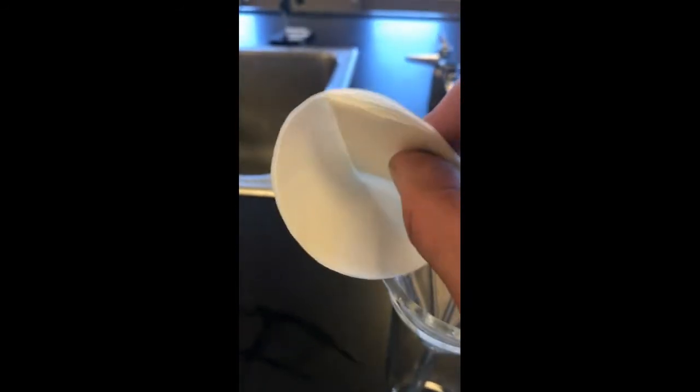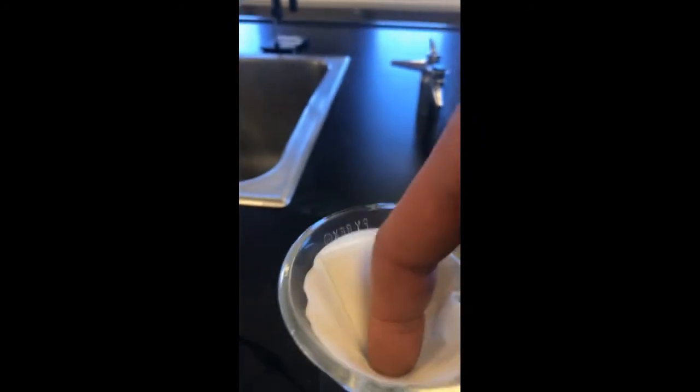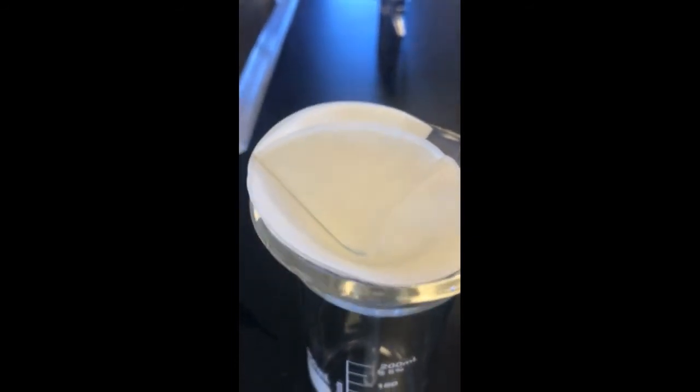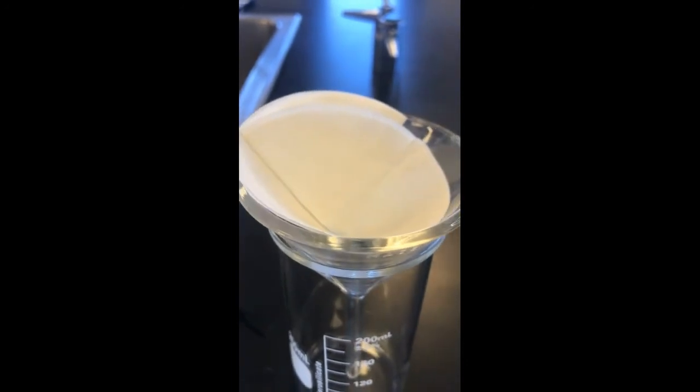Now, after the aluminum has finally dissolved, I've taken a piece of filter paper that was just a circle, and I push it into a funnel. Once this is fully dissolved, I'm going to pour the liquid and the precipitate, the solid that is floating in there, into this filter paper.